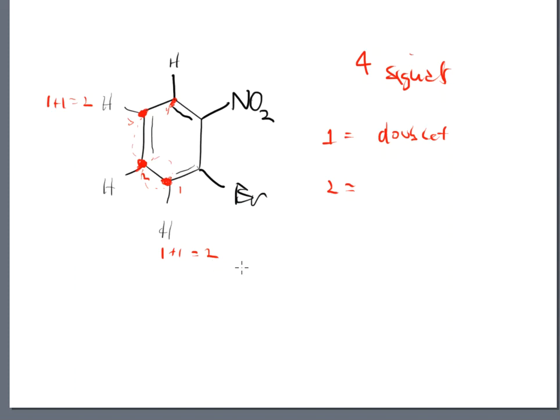And then we've got to figure out, what do we have, right? Is this a traditional type of 2 times 2, which is 4? And that is basically kind of the same train of thought that we've always done, and that's what we would do here as well. So at first glance, I would say, all right, this one's 2 and that one's 2. They are not equivalent to each other at all. And because they're not equivalent to each other, that's 2 times 2, which is 4, and that is a quartet. And I'm going to put a star beside of this one because I'm going to come back to that in just a second. But normally in the other example problems that we did, we would say it's a quartet and then we would move on. And that's what we're going to do right now, but we'll come back to it here in just a second.